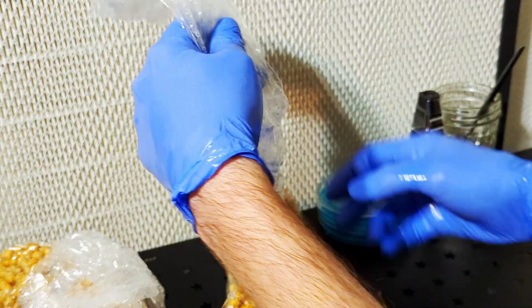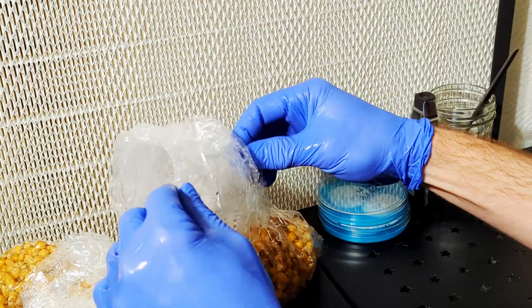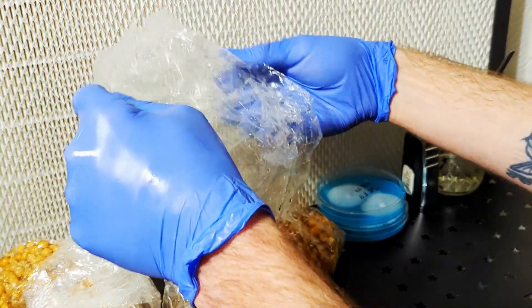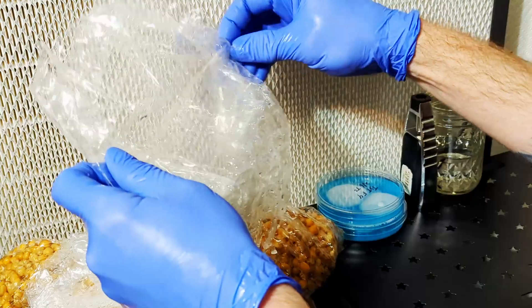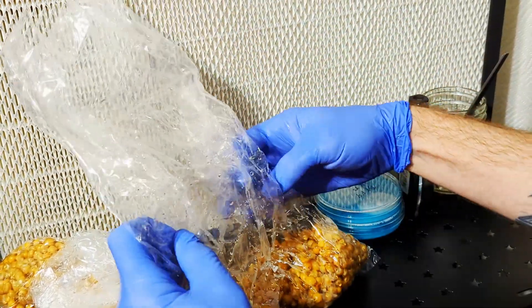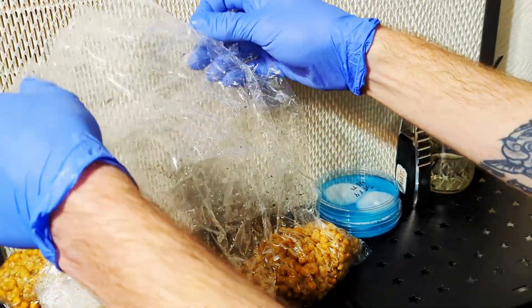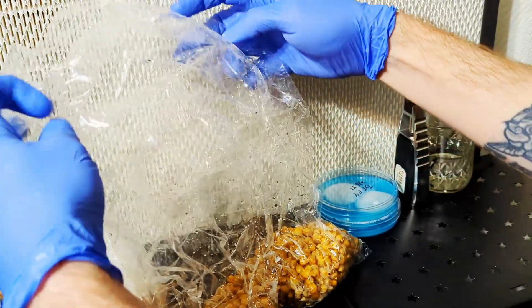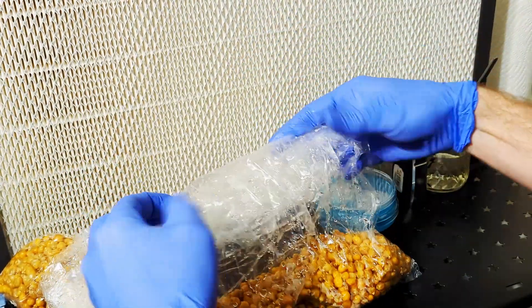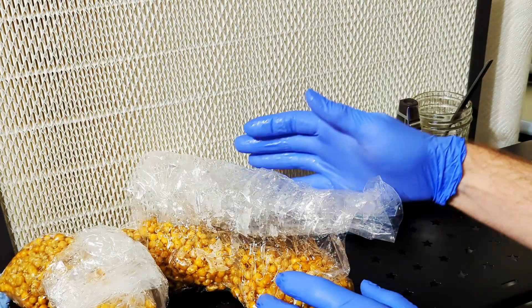Now let's get to these inoculations. I'll be using bags instead of jars for spawn. I switched to bags because they're easier to break and shake, and less dangerous since the bags won't break and cut you when you break and shake the grain. I like to get them unwrapped and ready before I start messing with the mycelium. I bring my pressure cooker with the bags in it to my flow hood, open it, and move the bags in the airflow so I don't have to clean them. If you move bags or jars through open air to your workstation, they need to be sanitized.